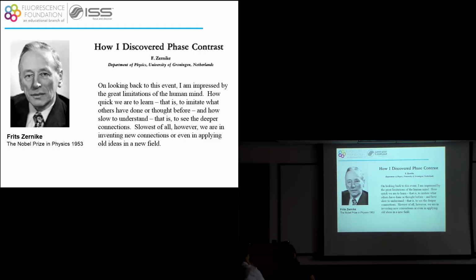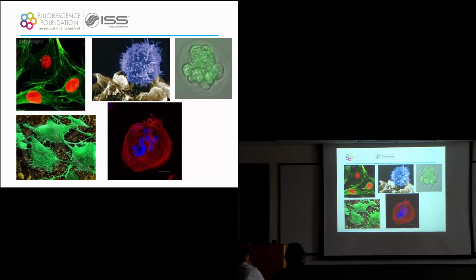So again, the fluorescence microscope was introduced in 1910, the idea of the pinhole, 1957, the first construction, 1987, the first commercial microscope, 1990. And so now everybody is doing confocal microscopy. Let's move on. So these are some of the pictures that you get with confocal microscopy.